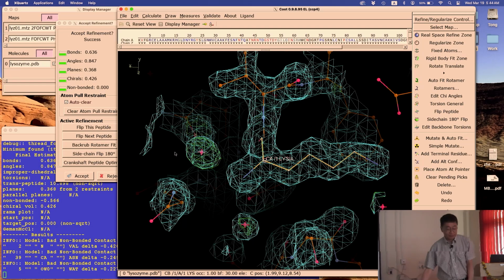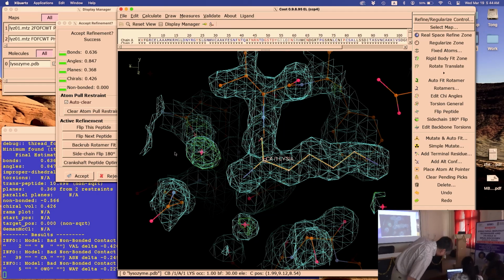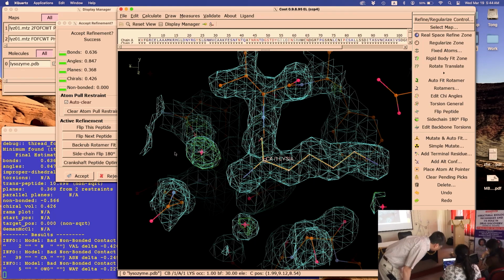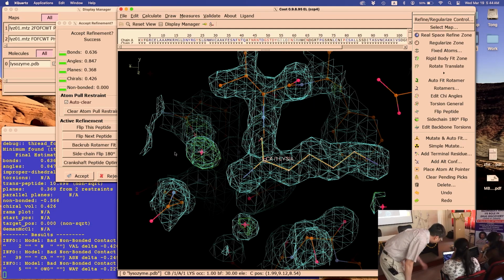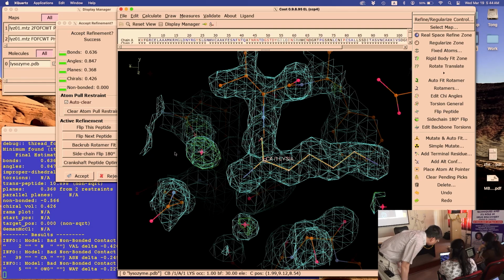Okay, let me look around again, see how many succeeded. Turn a little bit. You're looking at the arginine. Oh, you built the arginine in? So I have used this mutate. Like, I have added the arginine. If I add it by simple mutate, like here I am adding arginine. No, which residue number? It's the valine. Right? Residue 2, right? Should be a valine.